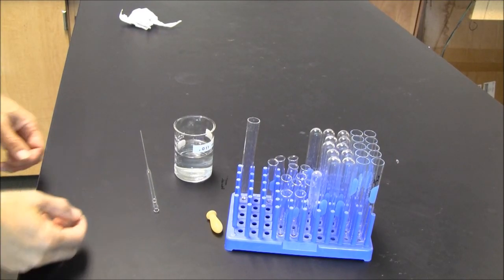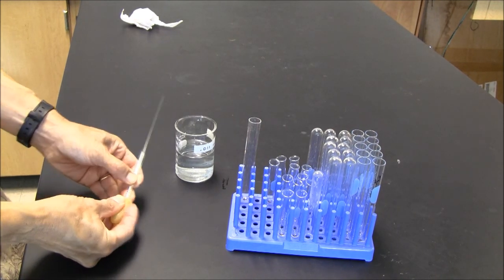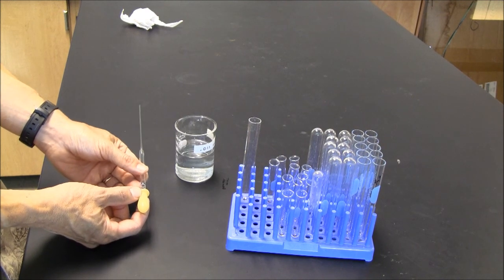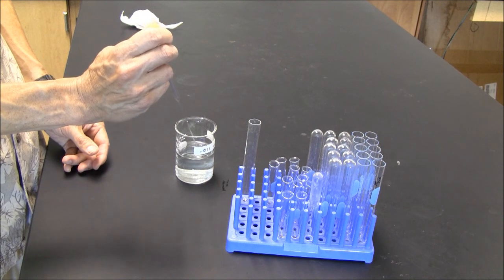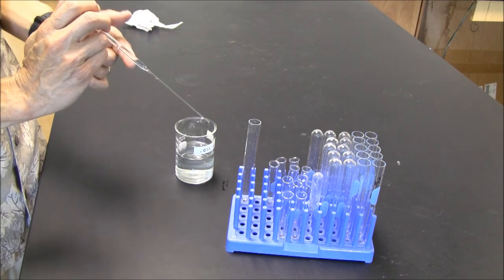When using a Pasteur pipette, first you must attach the bulb to the glass. It should slide on with a little difficulty. Don't need to push it on very far. Next, the tip of the pipette can be immersed in the liquid. And you can see the liquid gets drawn up.